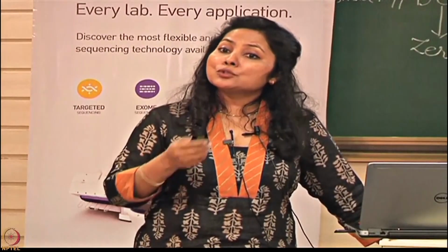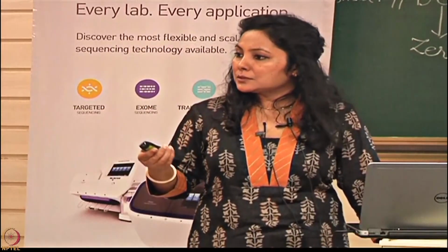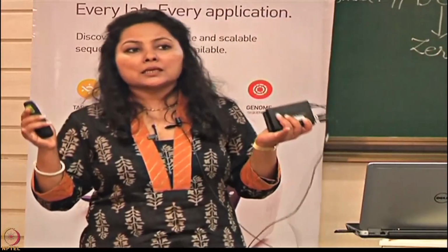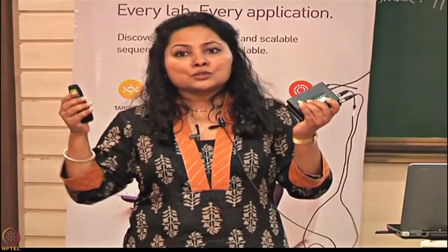Once you've broken down this genome, these are the fragments which you finally want to sequence, but you don't know what is there, so you need to have some adapters or linkers, which will help facilitate sequencing these regions. So in library preparation, you are enriching the region of interest, and second, you are ligating it at both the ends with linkers. These linkers are double-stranded DNA fragments, which are basically exploited so that the primer can then sit on these fragments.